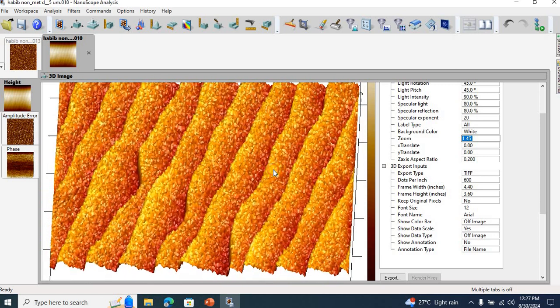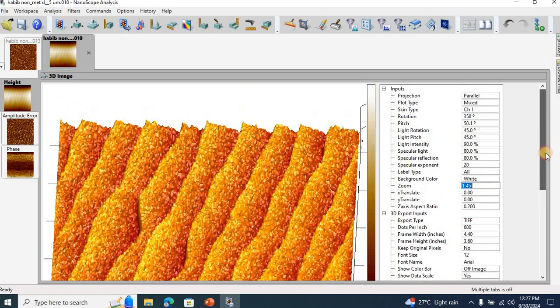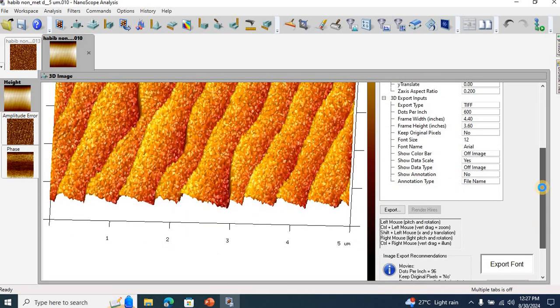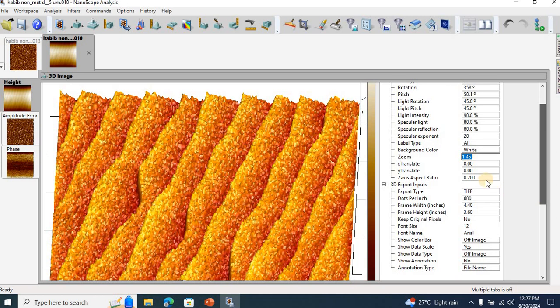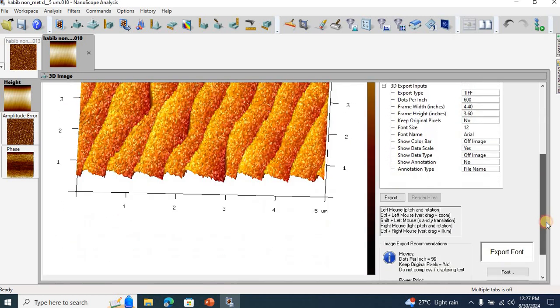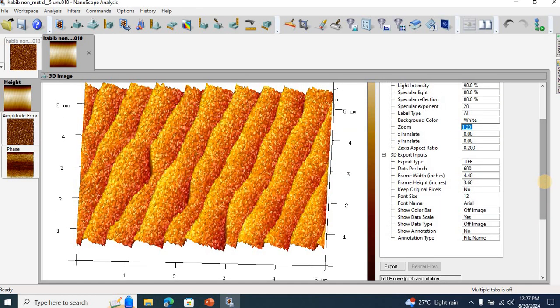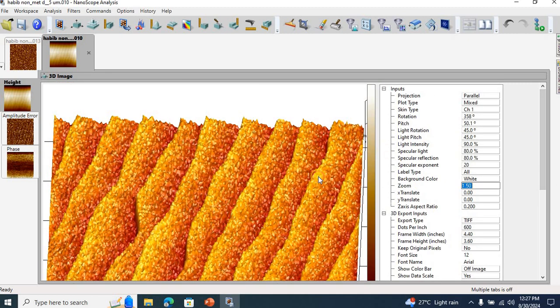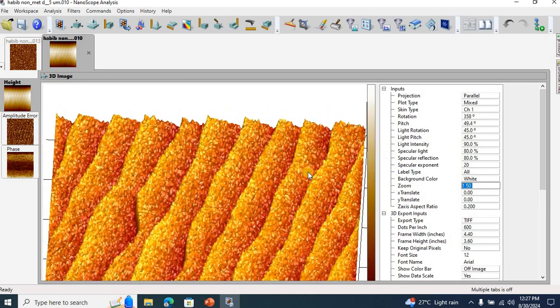You can select this figure and you can rotate it around as well. I like this view better. In fact, let me reduce it to like 1.45. So let me enter a value of 1.2. I like this better, but it's still smaller as compared to the scale. So 1.5 should be good. Cool.